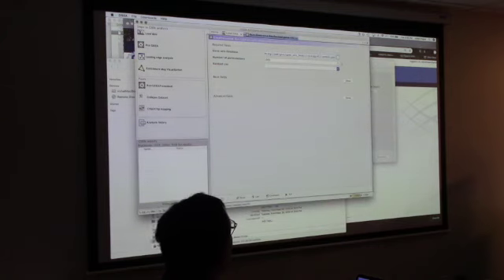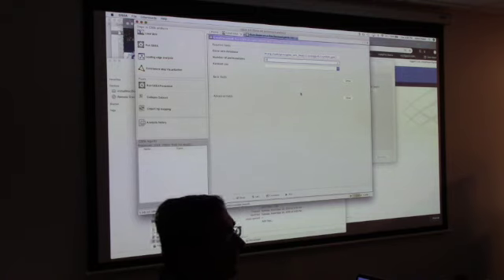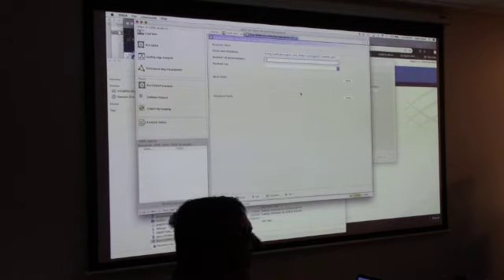Now you want the number of permutations. Remember, in order to get the false positive rate, it does the number of permutations for your random genes. So you don't want too many permutations initially. I'm just going to select it at 10. Once this runs, you can go ahead and select 1000. Initially I'm doing 10 because I don't want it to run for too long.